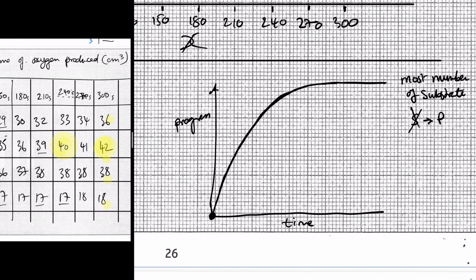Okay, so your curve must look like this, regardless of whether it exactly matches your data or not. All curves must do these things. One, it must go through 0, 0. Two, the rate at the beginning should be the fastest rate possible from the data, okay? And from that point on, the rate must always be going down. There's no speeding up later on just to fit your data, even if that's what your data suggests, okay?